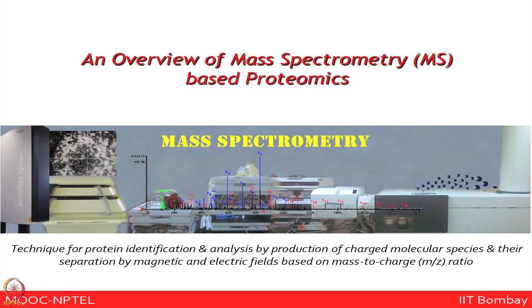So a lot of focus in the overall proteomics field shifted from gels to gel free proteomics, especially based on mass spectrometry. Let us now shift to the next module, looking at mass spectrometry based proteomics. I must say this particular technology has influenced very positively the entire field of proteomics and even metabolomics, and as a result you will see a lot of developments happening in this area.